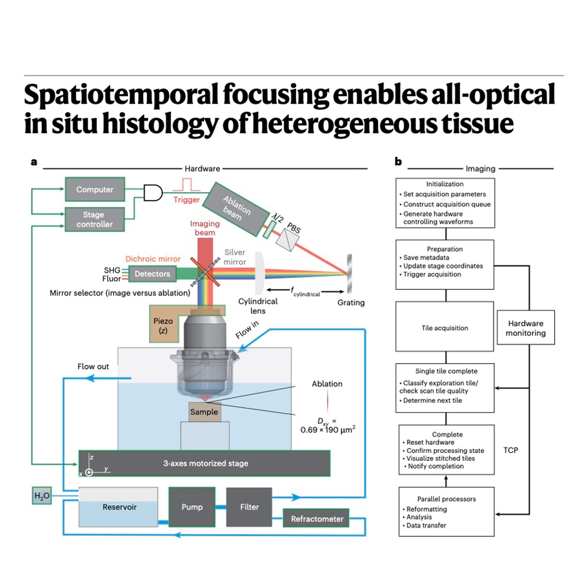Precisely. It needs to know exactly what material it's about to cut because, as we discussed, soft brain tissue and hard skull bone need very different ablation parameters to be removed cleanly and efficiently. Right. Different laser power, different exposure times. Exactly.